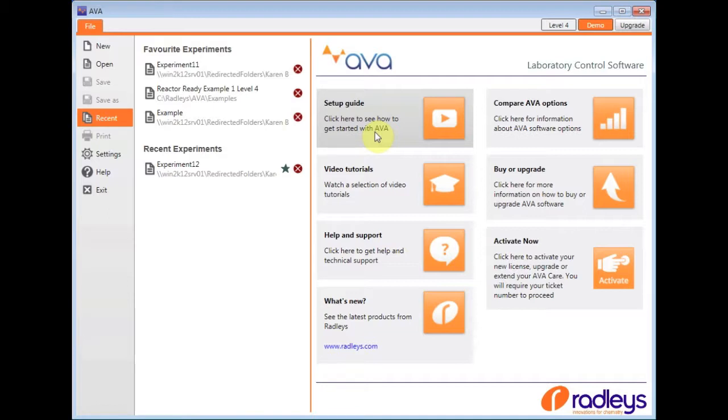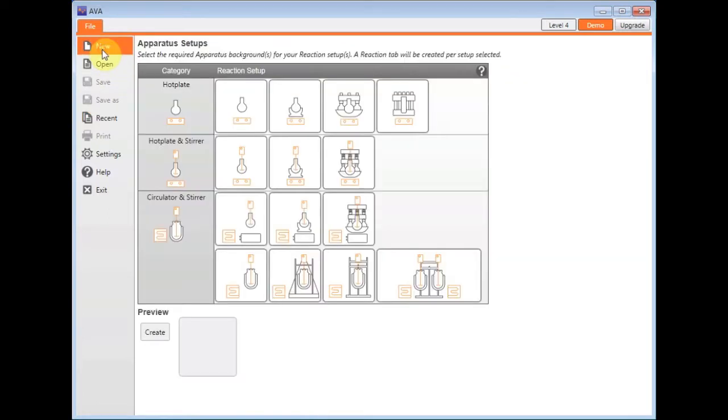I'm just going to give you a quick overview of the features and benefits of the software. To do so, I need to create a new file by going to the new option on the left-hand side.